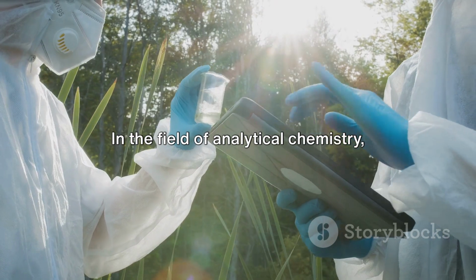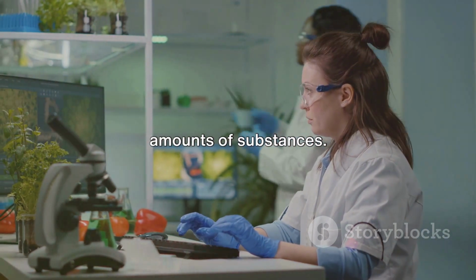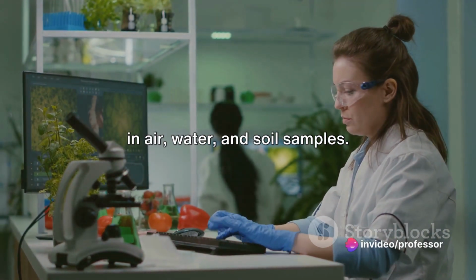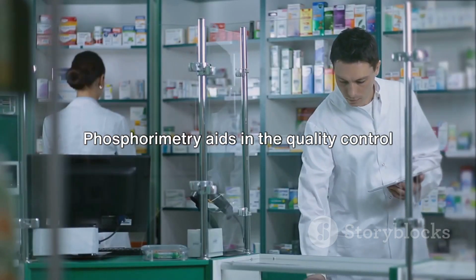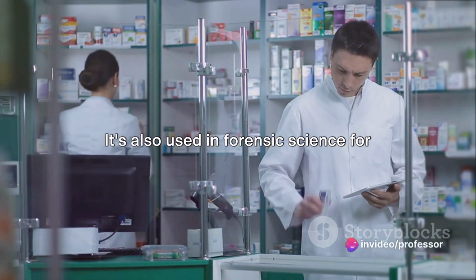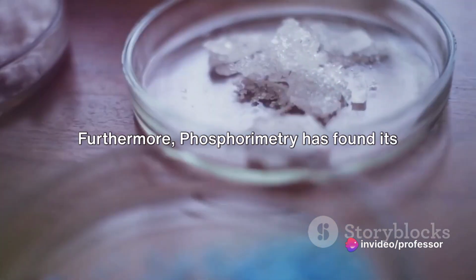In the field of analytical chemistry, it's used to identify and quantify trace amounts of substances. It's particularly useful in environmental monitoring, where it can detect pollutants in air, water, and soil samples. In the pharmaceutical industry, phosphorimetry aids in the quality control of drugs by detecting impurities. It's also used in forensic science for the detection of certain substances in criminal investigations.